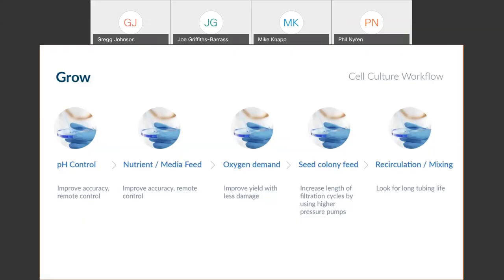Secondly, continued addition of fresh media provides nutrients for cells to grow, and oftentimes nutrient media is being exchanged, withdrawn, or extracted and pumped back in simultaneously, typically at matching flow rates. Maintenance of correct oxygen levels in this environment is also critical. It further ensures the stable environment that's needed to optimize the cell growth cycle as the cells go through their different phases.